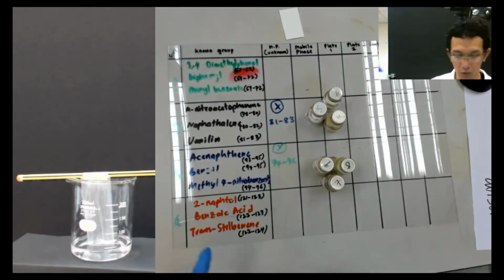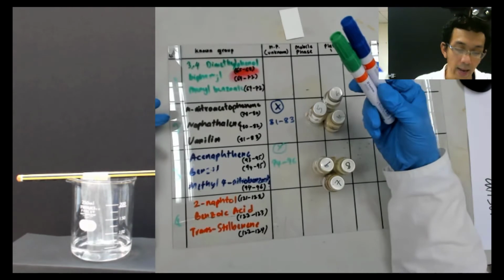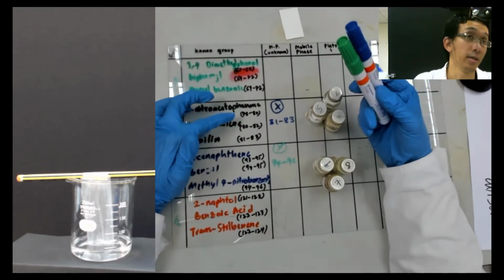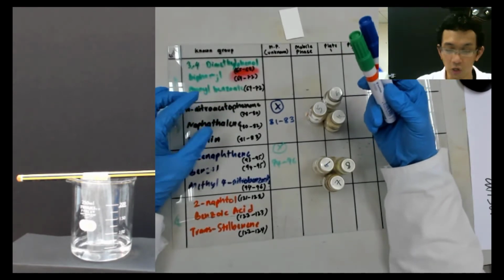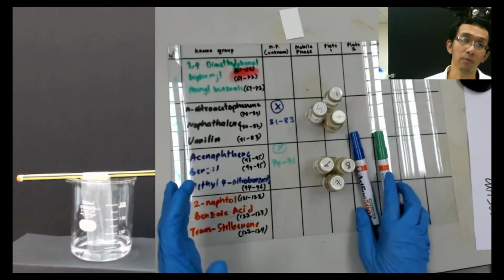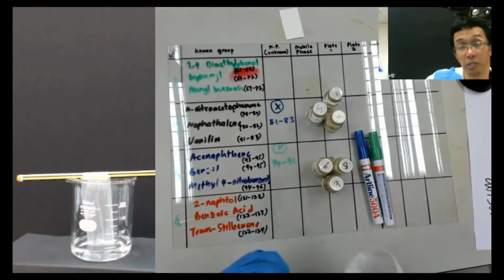Although here you sort of get the idea which one is which, the melting points are more or less near each other. In reality, it's not as clear cut as that. This is a pure compound, so the melting point is sharp.